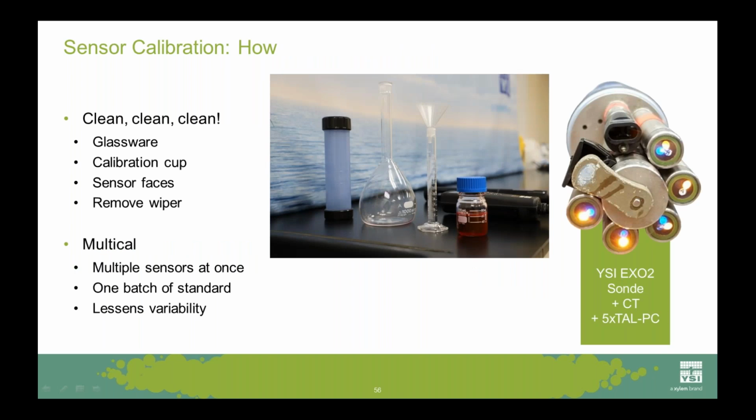Now, some other practices that I won't spend time on regard cleaning of the sensors and the tools used during calibration. Now, in the case of EXO, one of the great features is you can do what's called a multi-cal. And I want to thank a friend of mine at Lake Erie, Ed Verhami at Limnotech, who shared this picture with me where he's doing what's called a multi-cal.